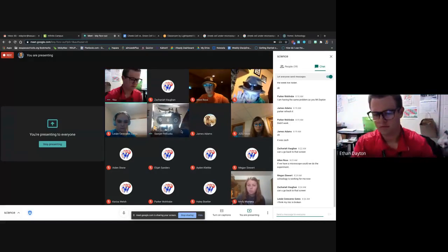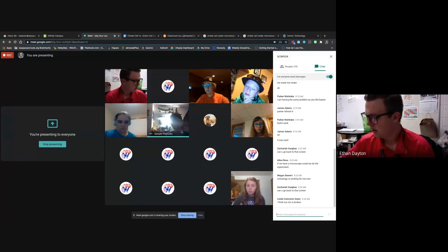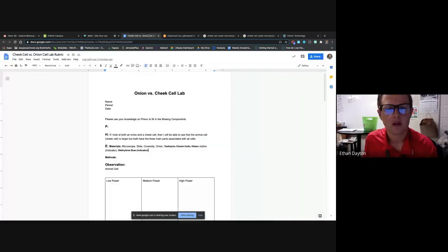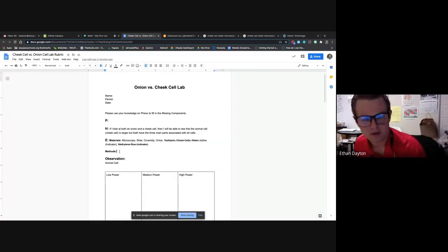So you can look at it easier. Yeah, pretty much. So I can see it a little bit easier. Good. Onions are white. The skin, if you cut it really thin, is kind of clear. Harder to see under a microscope. The iodine is an indicator to help us see. Thank you for that. Third time was the charm. Okay, so moving on to methods. We will talk about that after we do this.